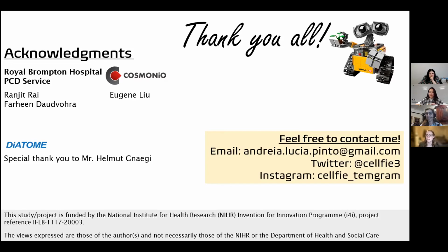And just another question of mine, also with the rollout: would the scientists have to put the images into NOUS, or would it be something like a plugin that you'd use in ImageJ, for example? So there are some options. Obviously, the center can have this setup, can have a big computer, a big server, can have NOUS, but your analysis won't be done in NOUS.